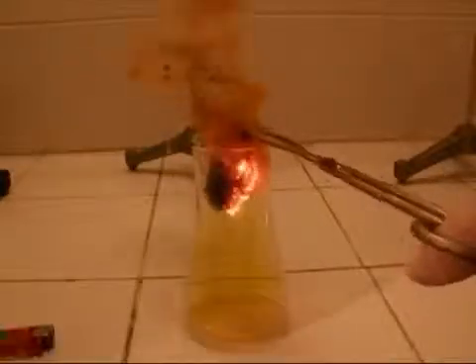Now to the first experiment. To show how reactive chlorine is, a piece of glowing iron wool is held into the Erlenmeyer flask. Immediately a violent reaction occurs. The iron and the chlorine are forming iron trichloride. It evaporates from the Erlenmeyer flask as brownish gas.